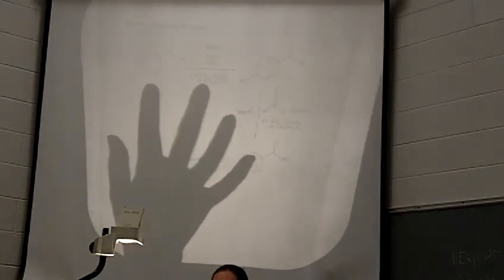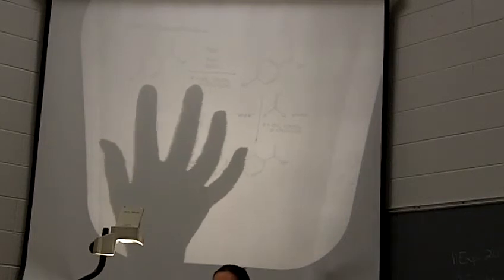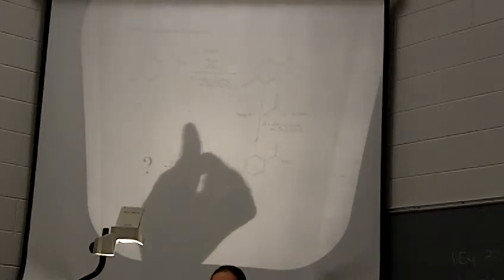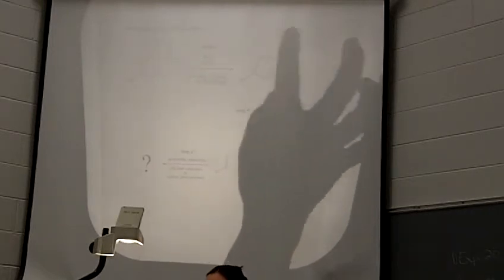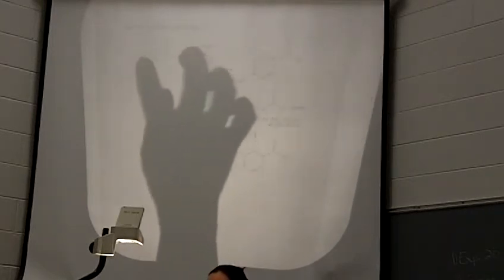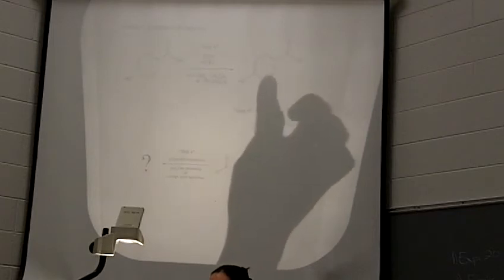So to do this, we've got three steps, hence 3 parts of an experiment along the way to do this. So you guys, this week, we'll start with 4-hydroxybenzoic acid, all right? Everybody is starting with the same thing, okay? But what you will vary, and we'll talk about how that works out here in a minute, is you will be using different alcohols to use the Fischer esterification to convert our acid to an ester, okay? So that is the first step. We want to go from carboxylic acid to an ester.